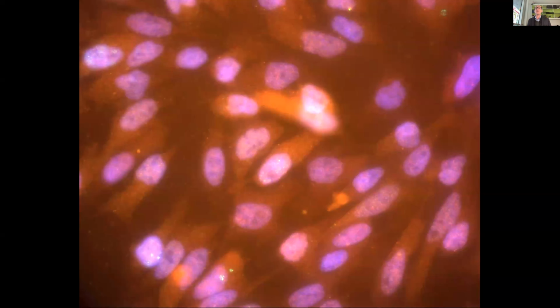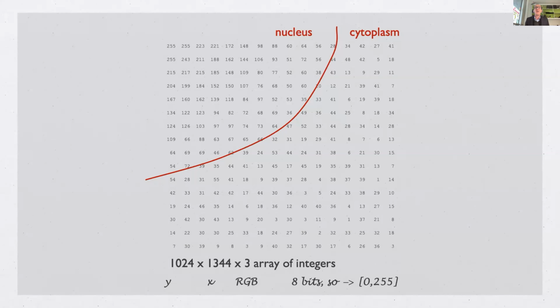Briefly, so this is the kind of image we did. We've seen in the introduction beautiful images of fishes. This is what we deal with nowadays. It's just pictures of a cell. And in the computer, it looks like this actually. The computer doesn't see images. The only thing it sees is actually an array of numbers, in this case a matrix, right?